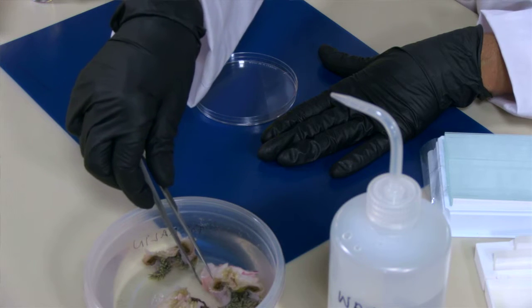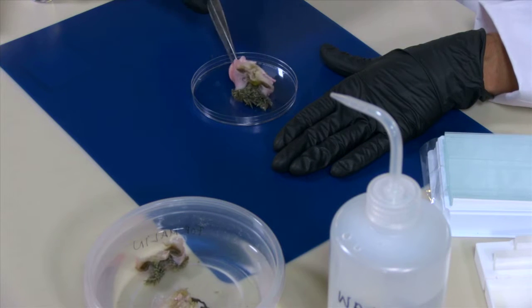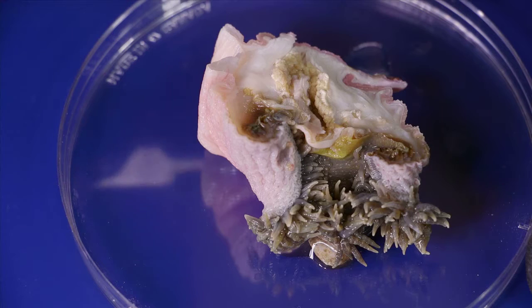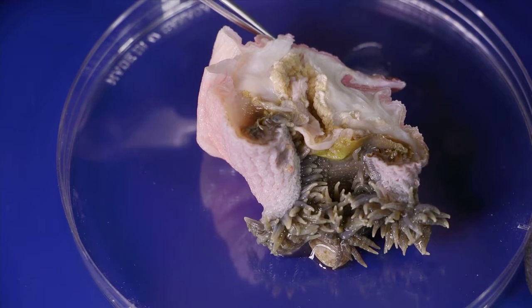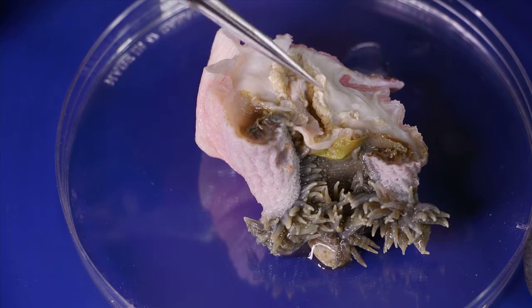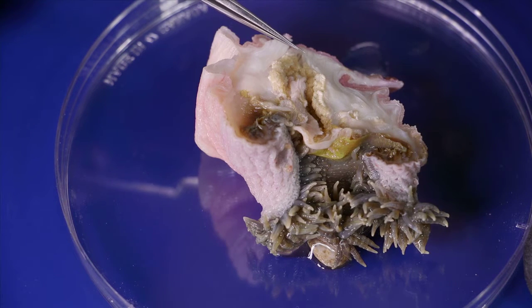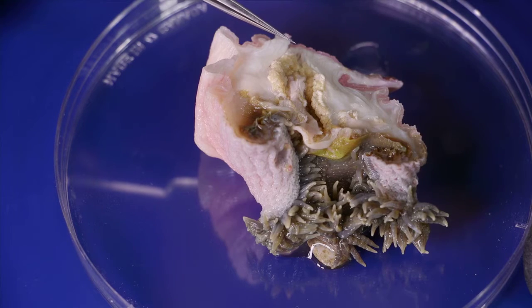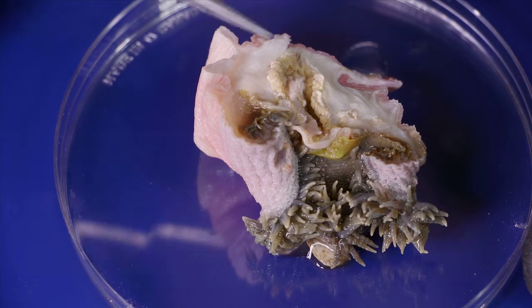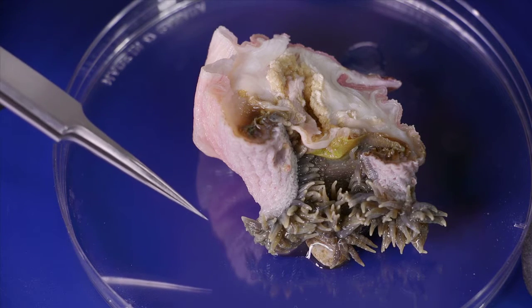We will start with a dissected specimen. You will need to make preparations of every part of the sea anemone. So you would need a preparation from the base, from the column, from the tentacles, from the actinopharynx and from the mesenterial filaments. In case your particular specimen has specific structures like acontia or structures in the column, you would also need to prepare those.